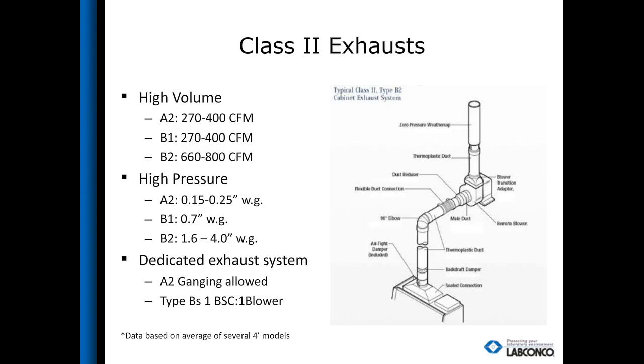You also have differences in pressures, and if you were talking to anyone that was sizing the mechanical system, you would hear that that's a very important number when it comes to the design and installation and operation of these systems. Basically, when you have a larger number, it makes it much more difficult to balance multiple devices on the same air handling unit, whereas on a lower pressure number that doesn't change, just like a fume hood, you can have 10 or 20 of those cabinets on the same blower. That adds efficiency to the design of a building and reduces repetition in both purchase parts and installations.